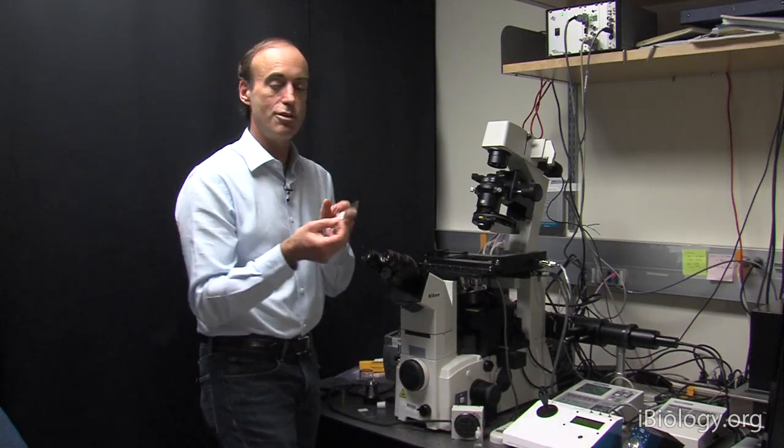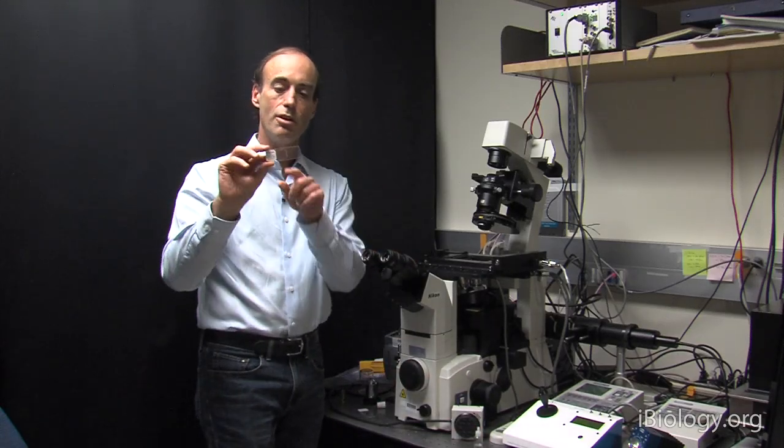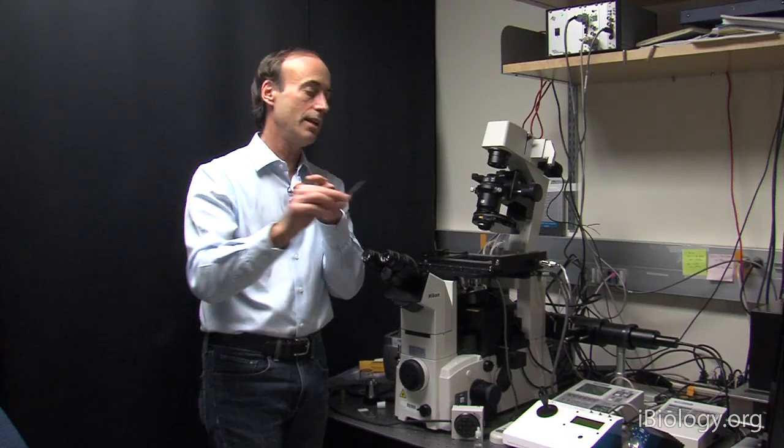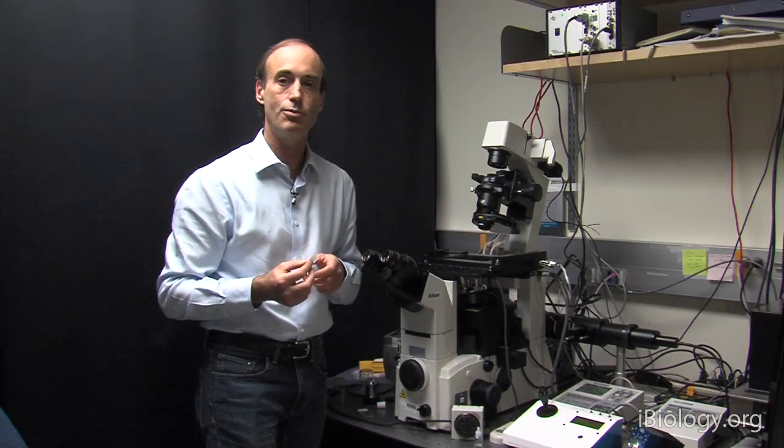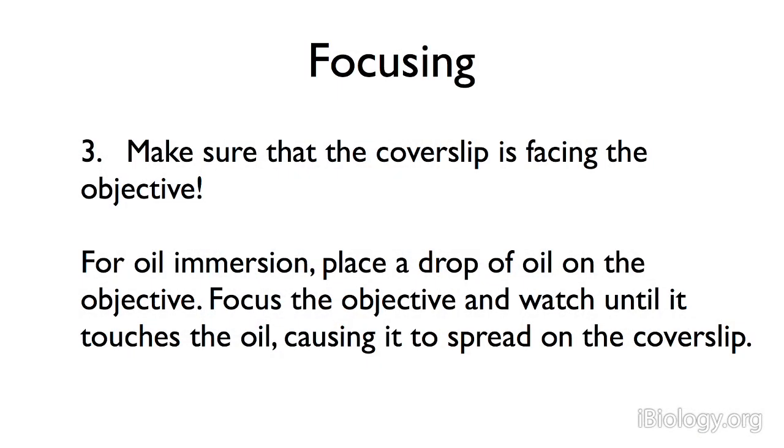Next, look at your specimen. Make sure that you put the coverslip side down onto the objective. If you're using oil, you just need one drop of oil placed on top of the objective lens, making sure not to touch it directly.